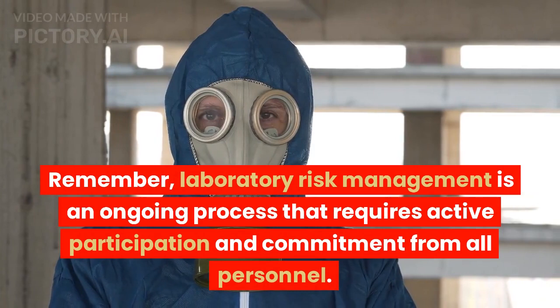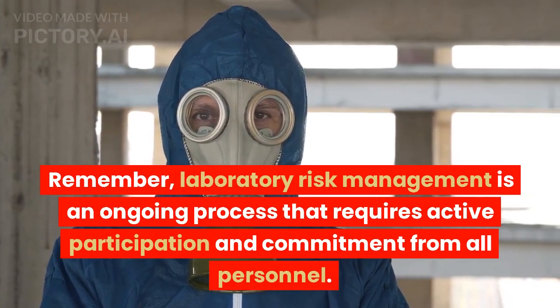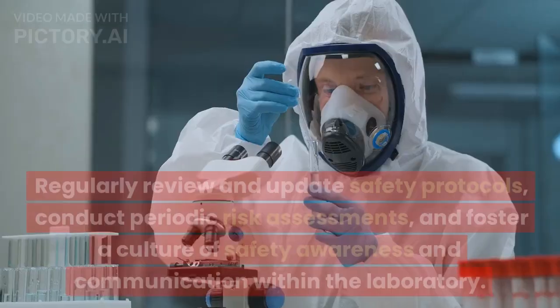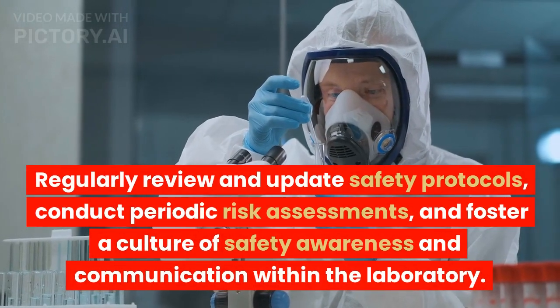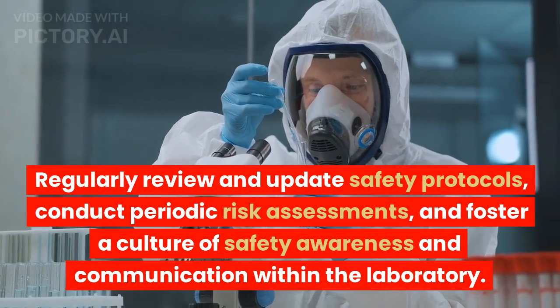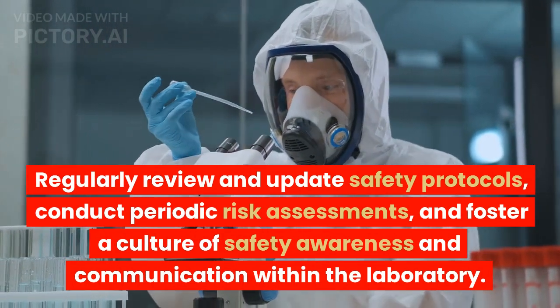Remember, laboratory risk management is an ongoing process that requires active participation and commitment from all personnel. Regularly review and update safety protocols, conduct periodic risk assessments, and foster a culture of safety awareness and communication within the laboratory.